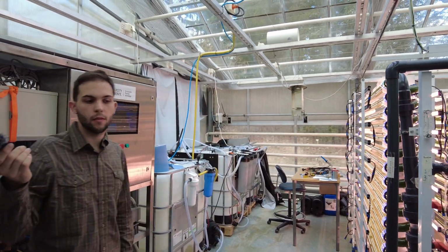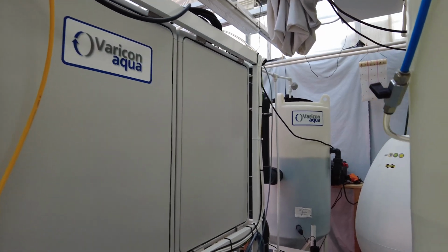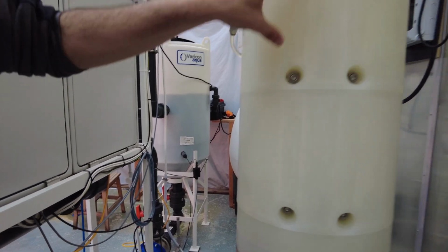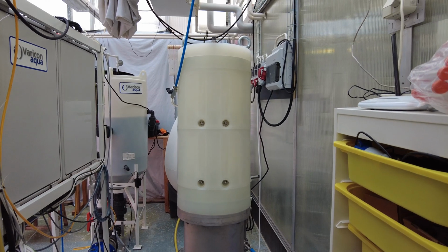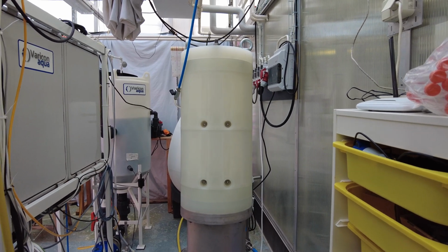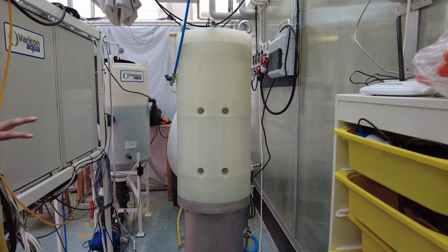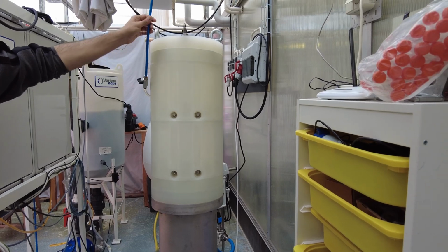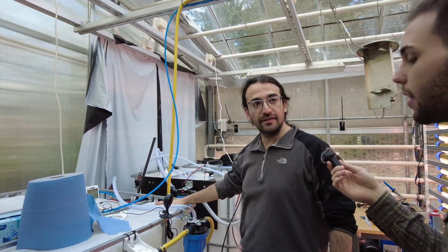So what we are doing is adding more wastewater to the system and elevating the water level in the vessel. From there, it's connected to a canister, and with that canister we are filtering the algae culture. So this is a filter, enabling us to separate the treated wastewater and the algae. We are getting a concentrated algae at the end from this filtration unit, and the wastewater we are collecting in different canisters. They're recycled.